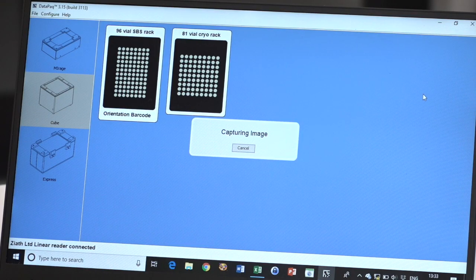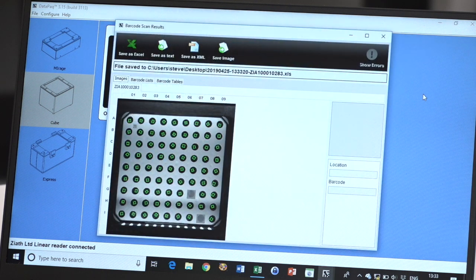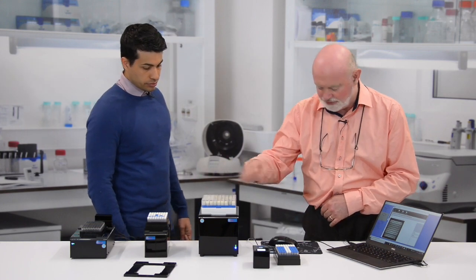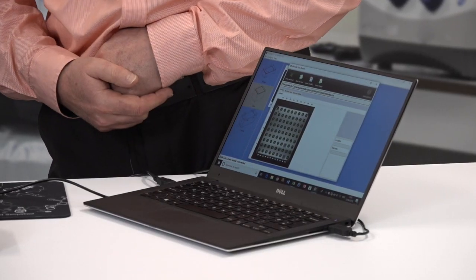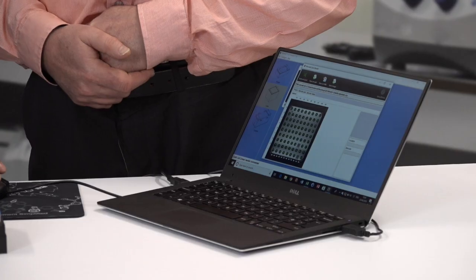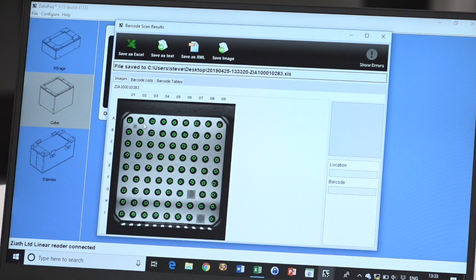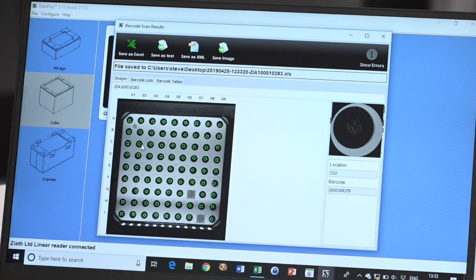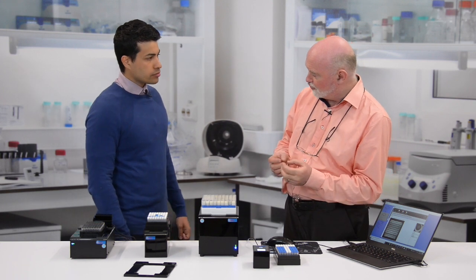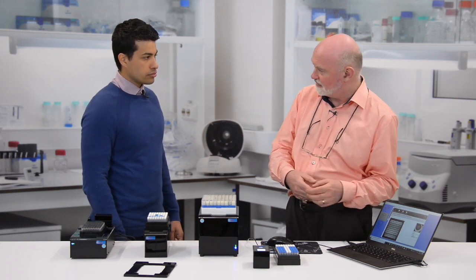You click that and it starts immediately and decodes the barcodes. Now we've got an image of the rack with all of the barcodes showing in green where tubes were located. Two positions were empty and are just greyed out. You can click on the individual barcodes to see the barcode position and the actual barcode itself — and the image of the actual tube as well. So if there was ice on it or it wasn't reading properly, you'd be able to quickly and easily see why.